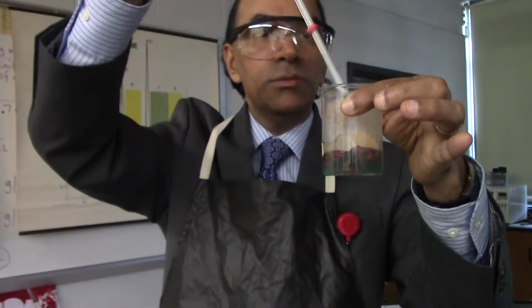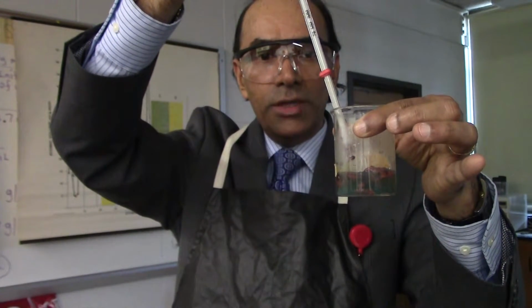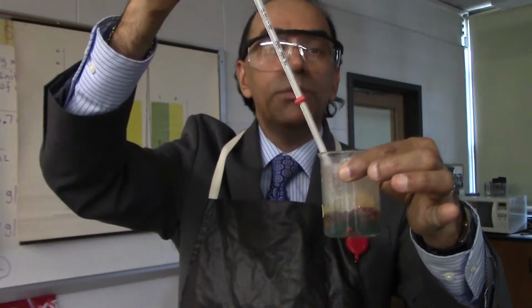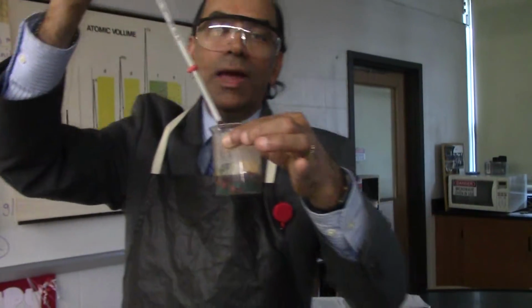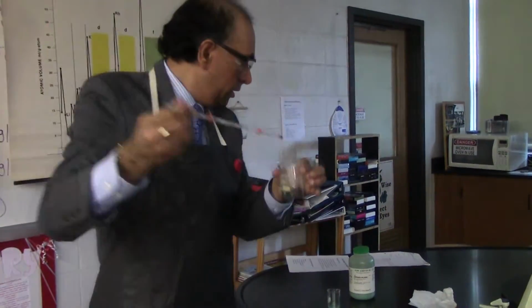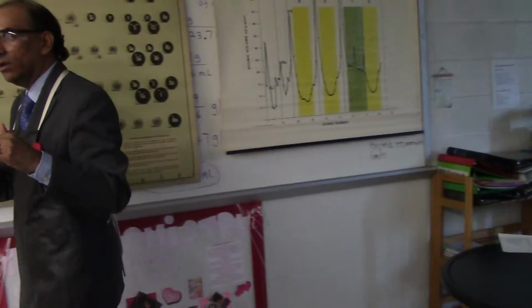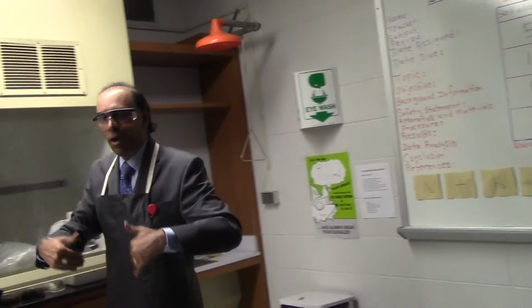All right, I see some white fumes coming up. Probably steam is coming up as the reaction is taking place. Now this is a reaction called a single displacement reaction. I'm now going to put this down. I'm going to walk to the board, and we'll have a little bit of a discussion of what goes on and how you can use modeling to explain what's happening inside of this beaker, at the subatomic level.